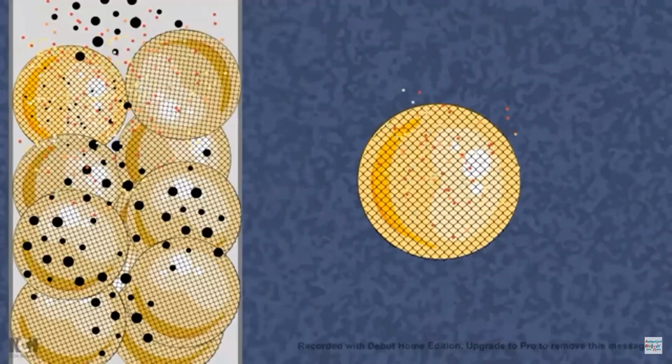Gel filtration chromatography has the column packed with beads which are porous. These beads are either made up of agarose, which are known as Sepharose beads, or let's say dextran, or let's say polyacrylamide. In all of these cases, it has pores inside it. So the protein samples which are very small in size can really enter the bead. And as they move through the column, they're actually retarded because they're moving slowly through these beads.